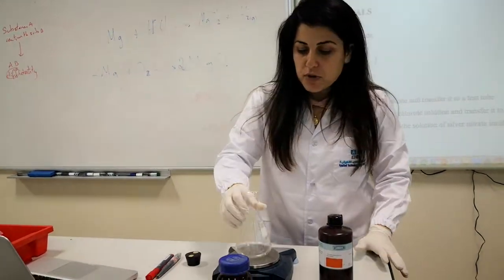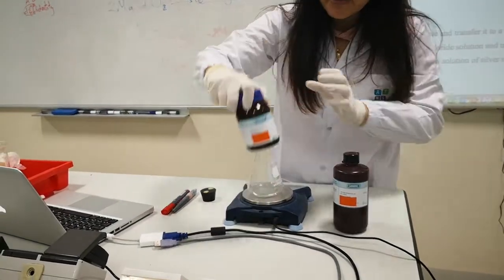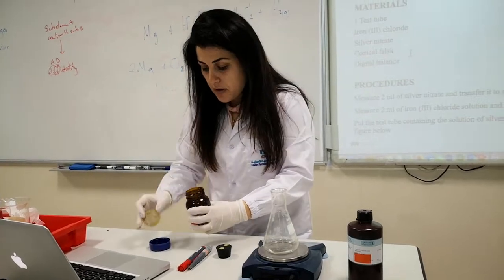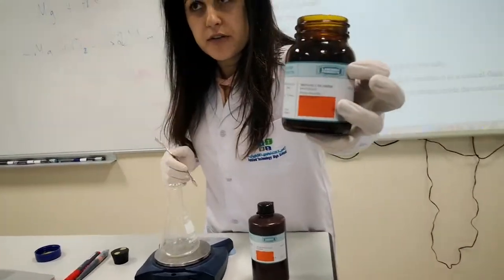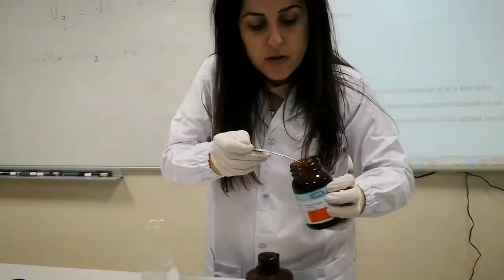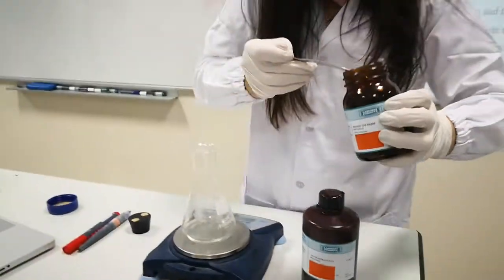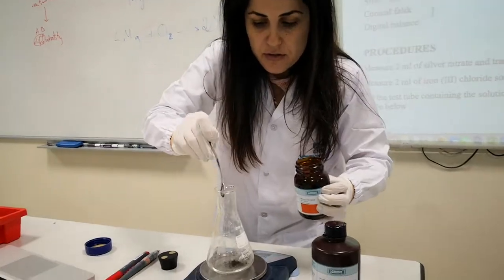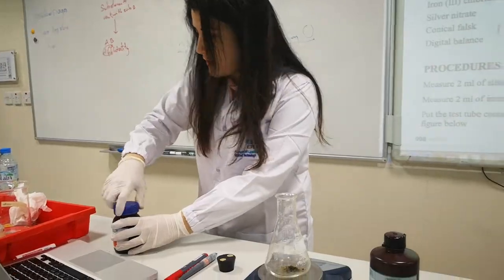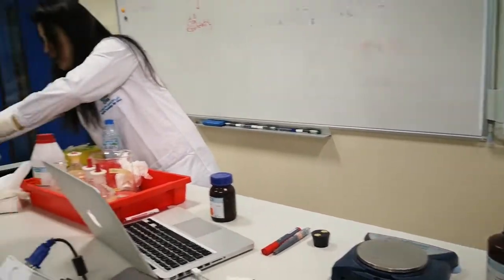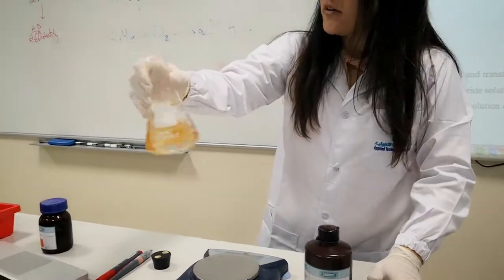First, I'm going to put the flask on the balance. In the flask, I am going to add a little bit of iron(III) chloride and dissolve it in water. So I'll add iron chloride here and add water to the solution to dissolve it.